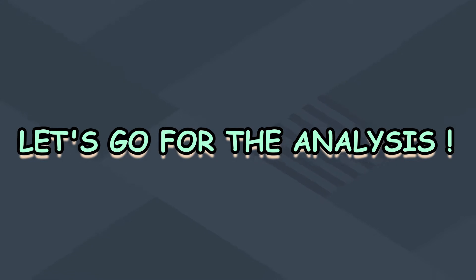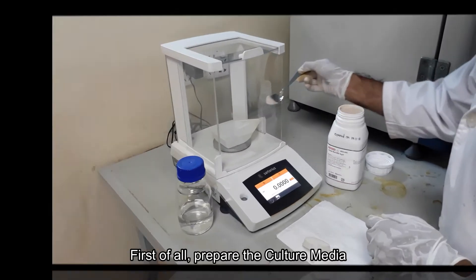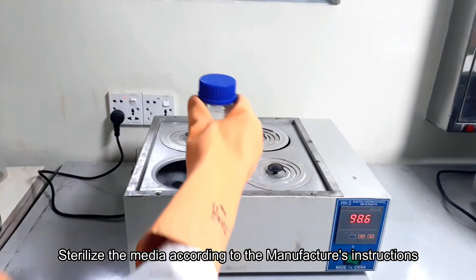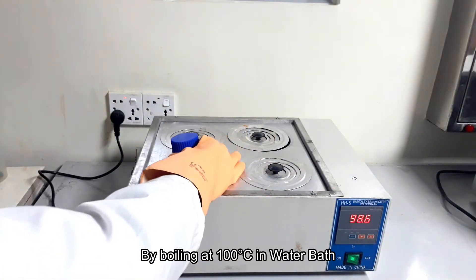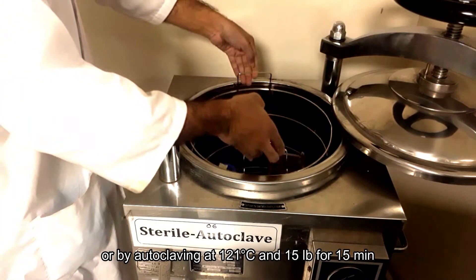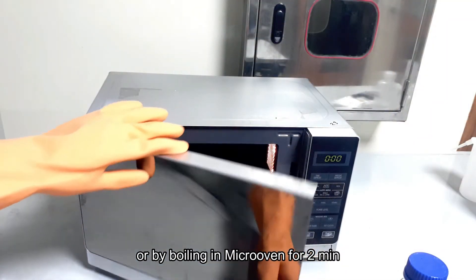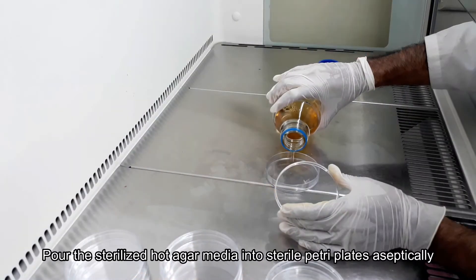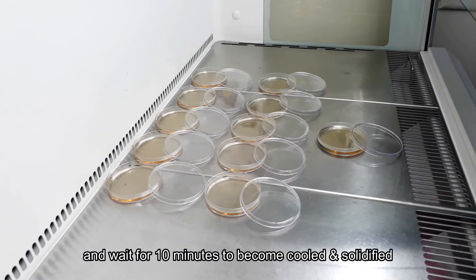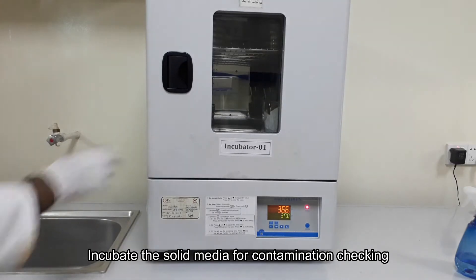Let's begin with the culture media preparation. Take the weight of agar media and mix with distilled water following the label on the media container. Sterilize the media according to the manufacturer's instructions. Some media need to just boil at 100 degrees Celsius to dissolve the media content, some need autoclaving at 121 degrees Celsius and 15 pounds for 15 minutes, and others need to boil in a microwave oven for two minutes. After sterilization, pour the hot agar media into sterile petri dishes and wait to cool and solidify before use.